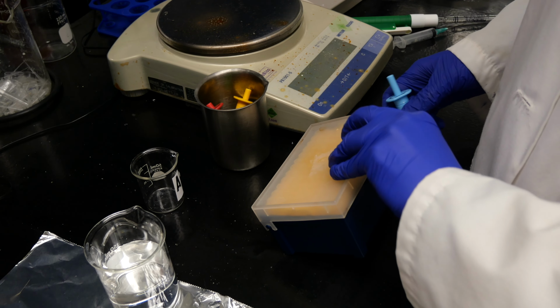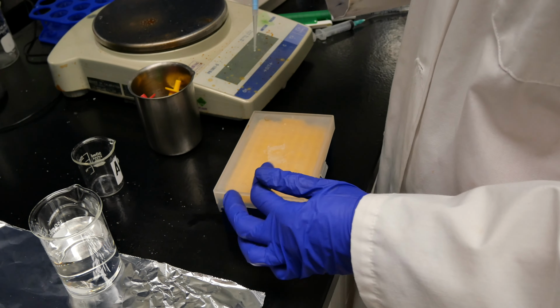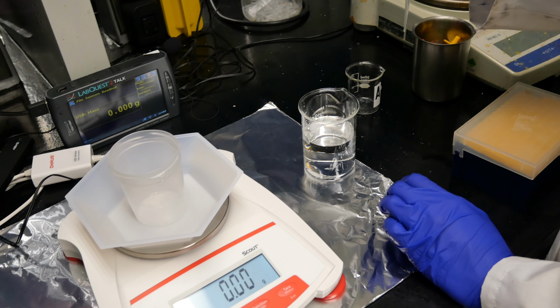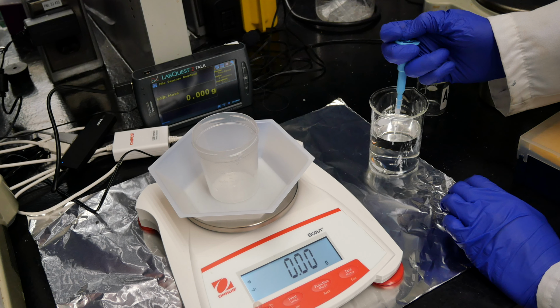The way you use them is you attach a pipette tip to the end of the fixed volume micropipette, then depress the plunger on the top of the fixed volume micropipette to push out air. Place the tip into your liquid, then release the plunger so that the liquid is drawn into the tip. Put your tip into your next beaker and then depress the plunger to push the liquid out.